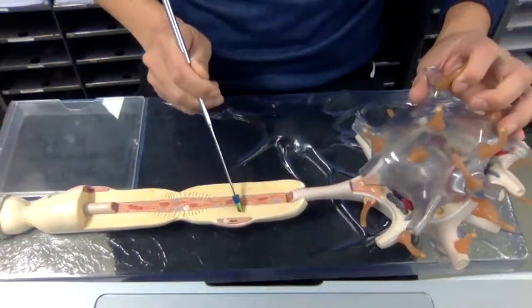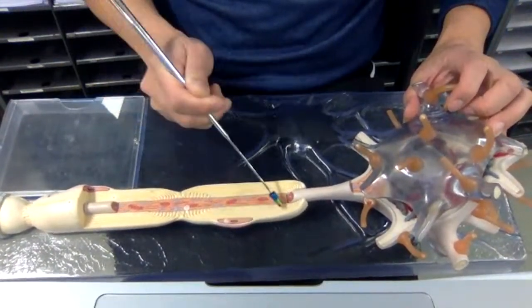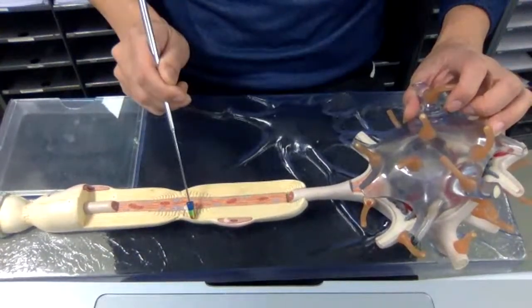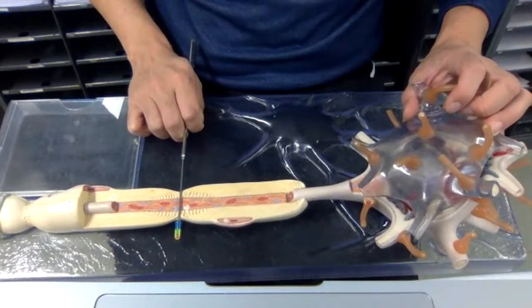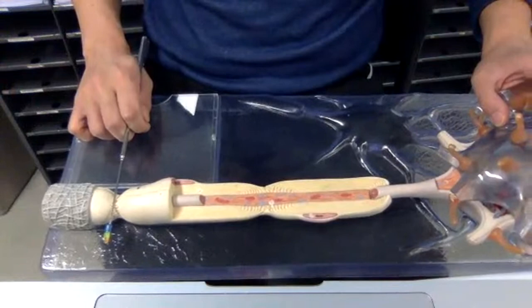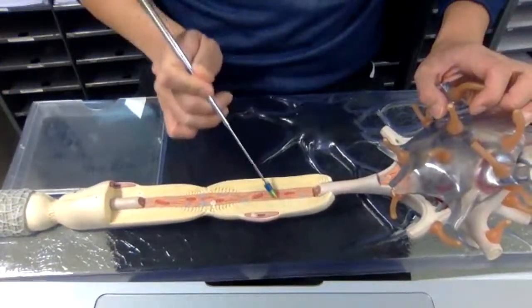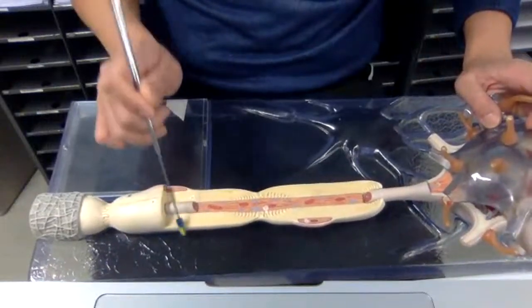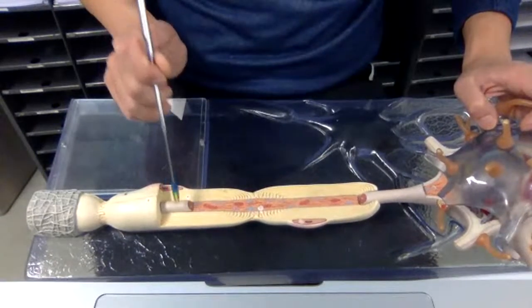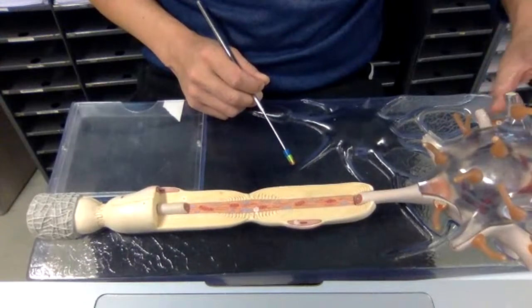We've got stuff surrounding the axon. You can see a nucleus here, and then all these layers. So this is myelin. So this is a myelin sheath. This is a gap. This is the node of Ranvier. Myelin sheath, another gap. So if this is a single cell wrapping around the axon here, and then here's another single cell wrapping around the axon, what kind of cell is this? Which glial cell is wrapping around the axon? Go ahead and type it in the chat.